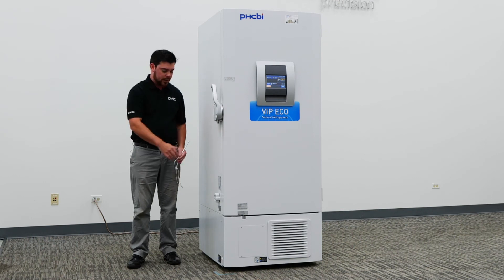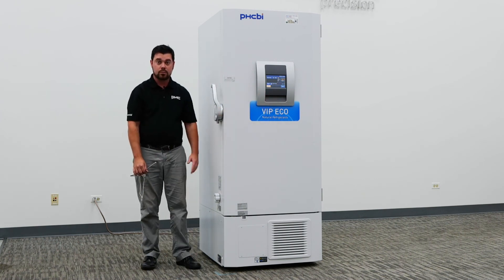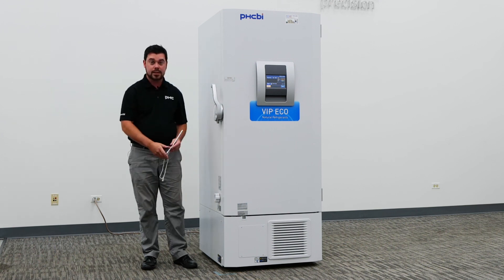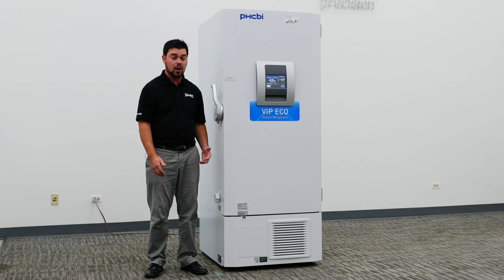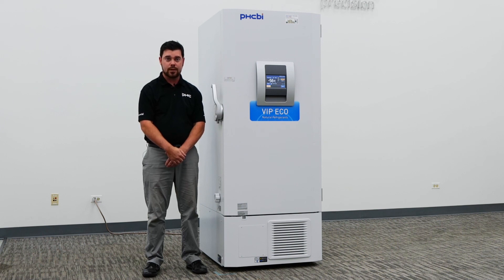If ice accumulation forms in this portion, you won't be able to utilize the manual vacuum relief port. PHCBI ECO series units do come standard with an automatic vacuum relief port, but it is still nice to utilize the manual relief port as needed. Once the port has been placed back on, it's important to screw it all the way clockwise until you get a nice tight seal. We do recommend annual calibration and adjustments such as latch, hinge, and other adjustments that can be made by a qualified service technician.